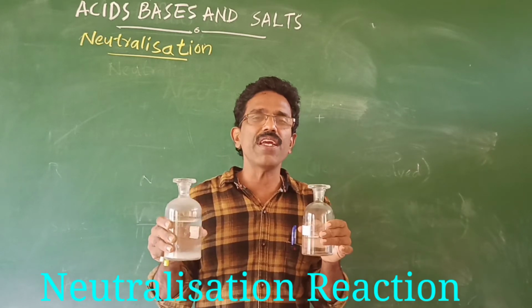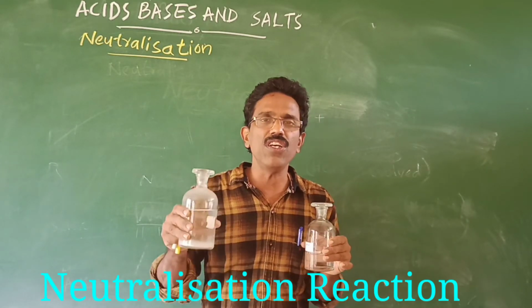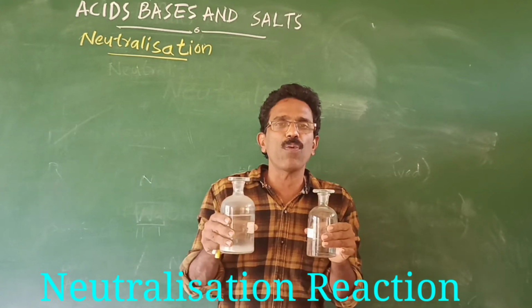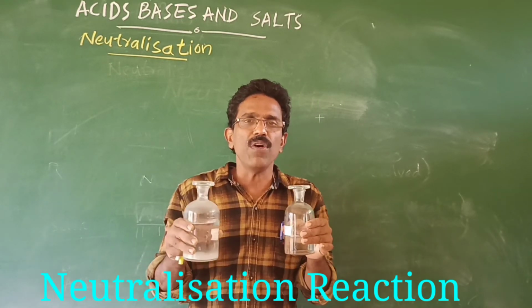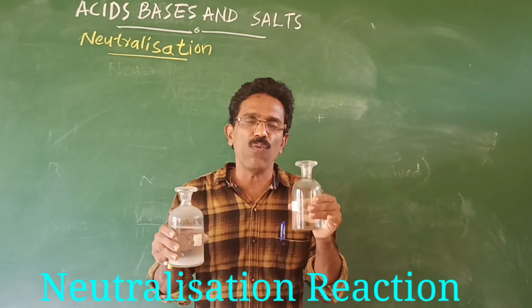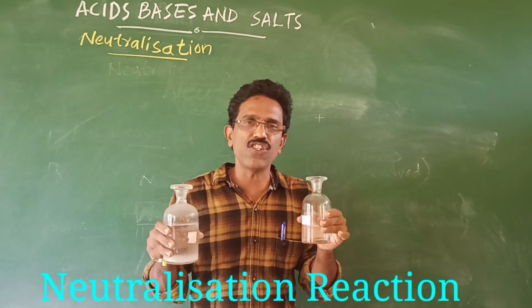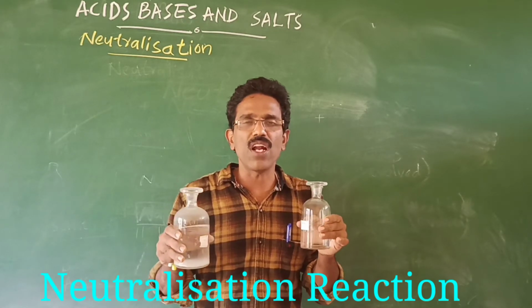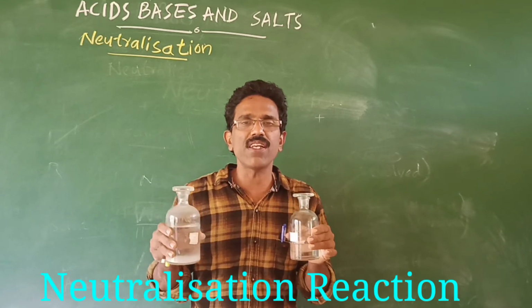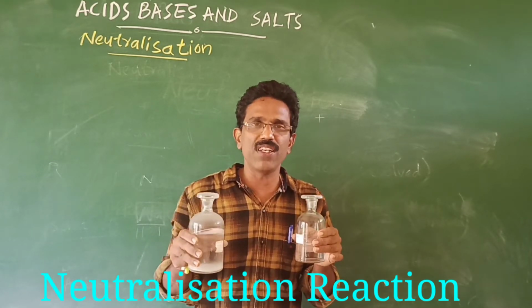Because heat energy is produced, and that heat energy heats up the reaction mixture. That is why we feel hot when we touch the test tube soon after neutralization. So let us perform an activity to understand the process of neutralization.